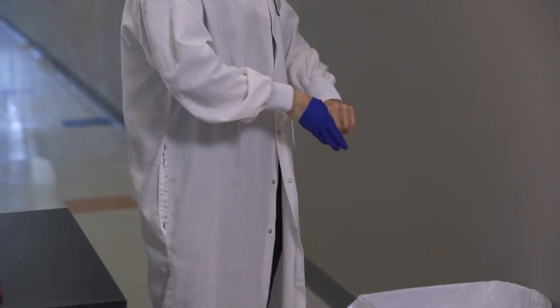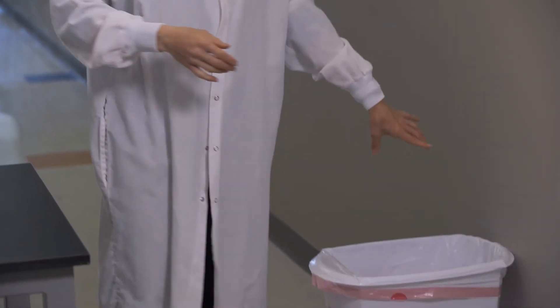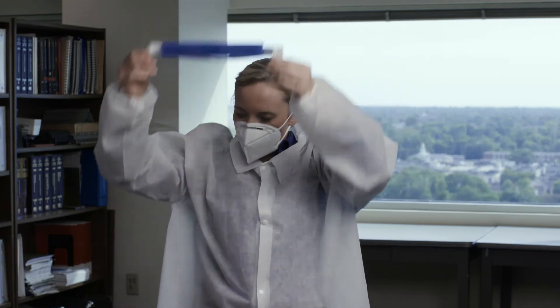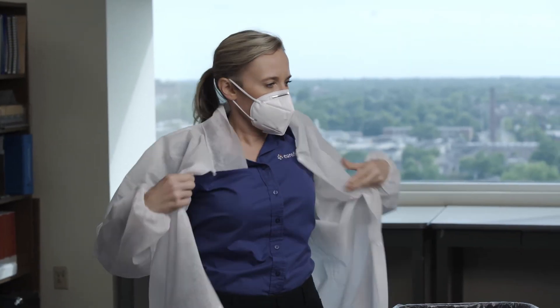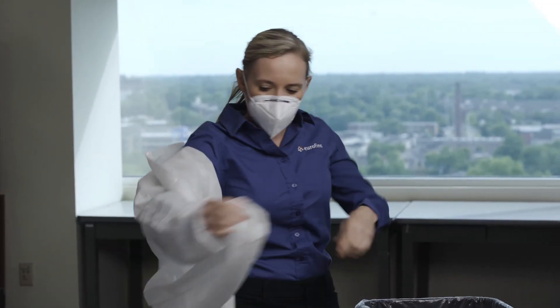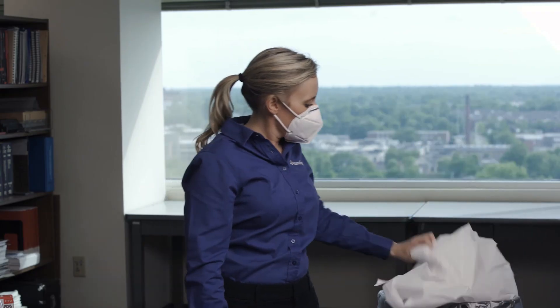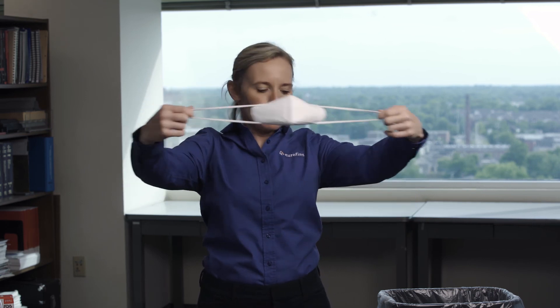Pull at the wrist of the glove so that it turns inside out and can be discarded. Remove your glasses or face shield by making minimal contact with any of the protective surfaces. Remove your gown or lab coat, being careful not to touch the exterior sleeves. Finally, remove your mask or respirator — do not touch the mask, only the straps or ties.